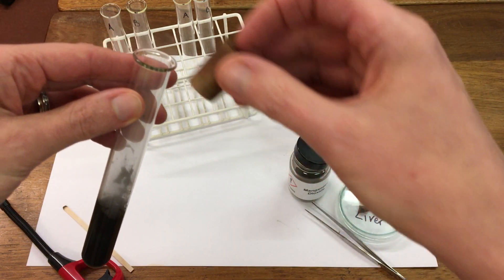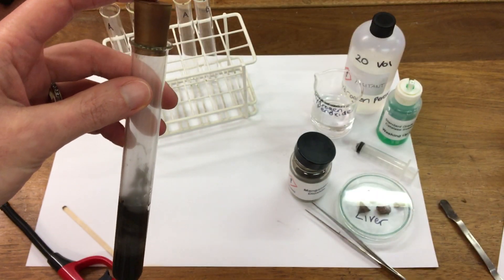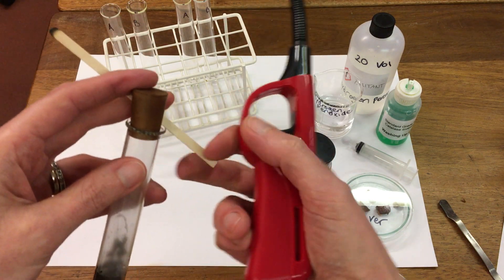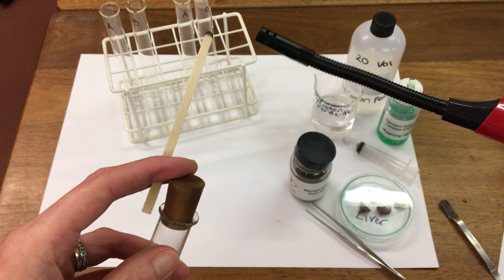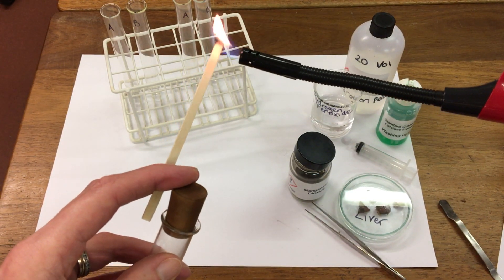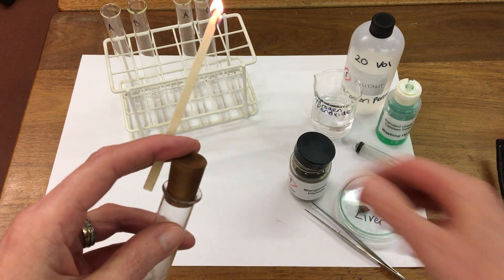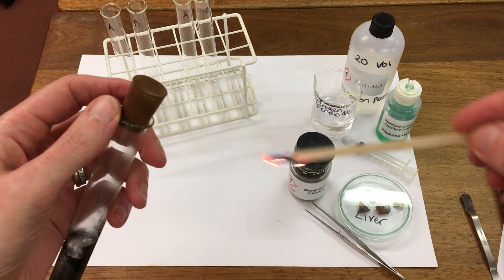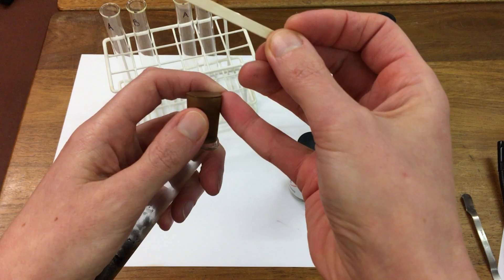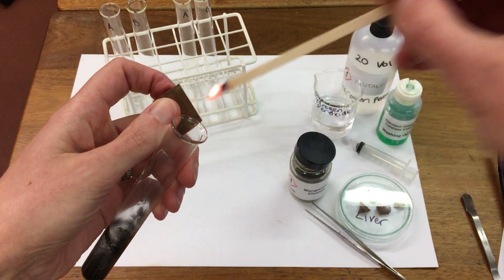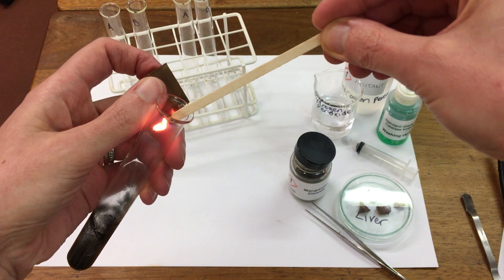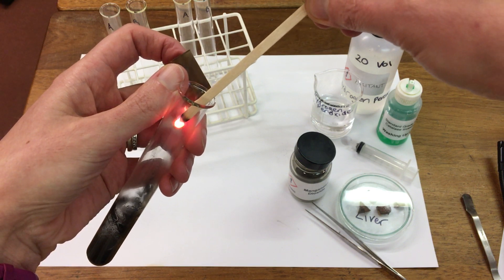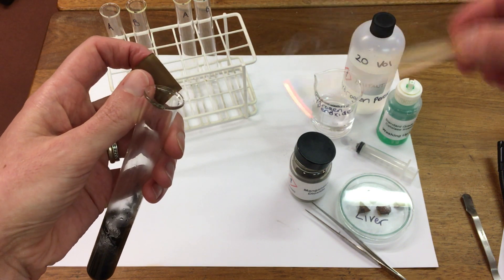Now I'm going to trap the gas being produced by using a stopper. We can then test this gas by using a glowing splint. So I'm going to light our splint. We'll then blow it out. We can see the gas being produced is relighting the glowing splint. This is the test for oxygen.